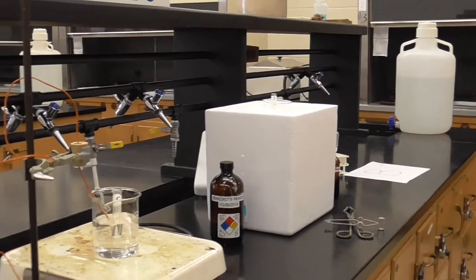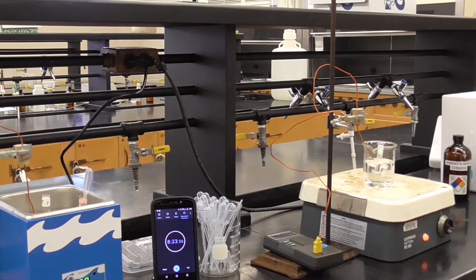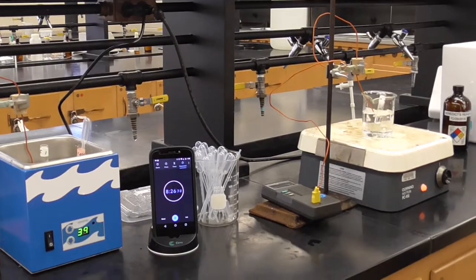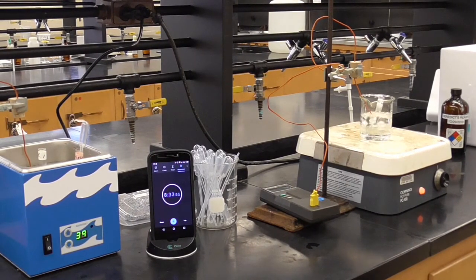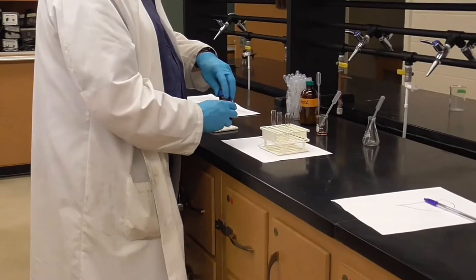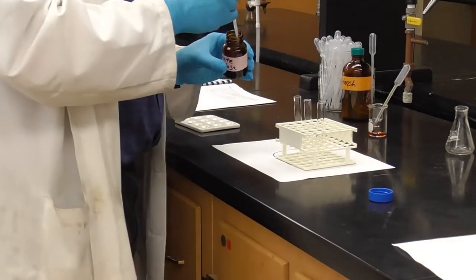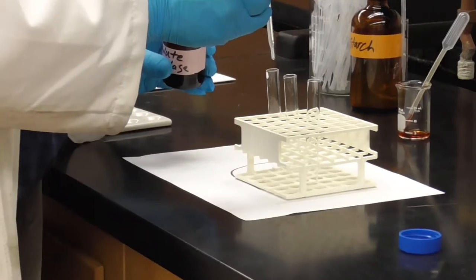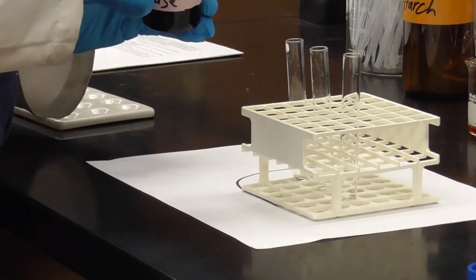Step 2, add 4 drops of the amylase solution to 3 other test tubes and place them, 1 in each bath. So we need 3 more test tubes that will do the amylase. Perfect. Thank you. 1, 2, 3. And we want our amylase solution about 4 milliliters. No, I'm sorry. 4 drops. 4 drops, and not a whole lot. 4 drops in each one.